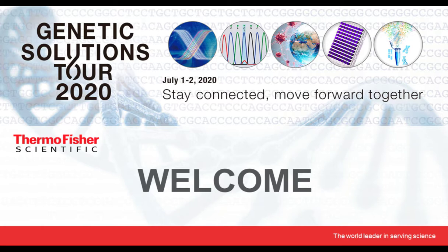Thank you, Emily. So the next question I would like to direct to Harita. Your question would be, besides TaqMan, are there other chemistries for microRNA analysis by real-time qPCR, like any other platform for real-time RT-PCR that does not use a probe? So the two chemistries that we offer for RT-qPCR are based on the TaqMan probes. We do have other solutions which are not RT-qPCR based, such as the microarray assays for detection of microRNA. But for RT-qPCR, we only have TaqMan-based assays.